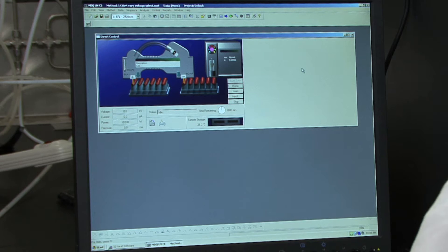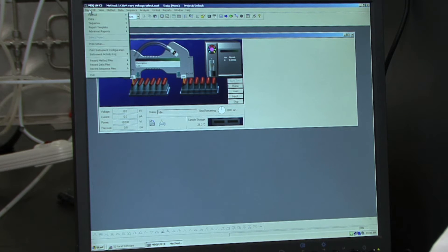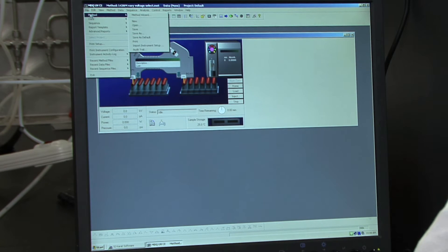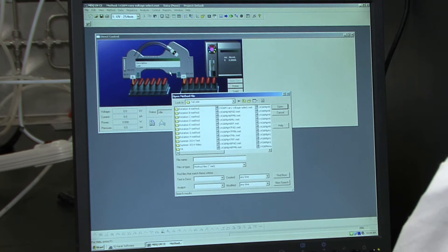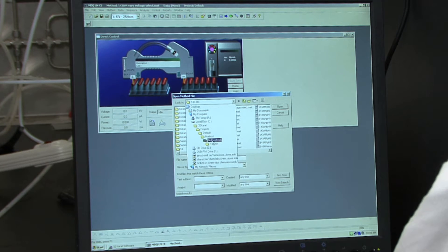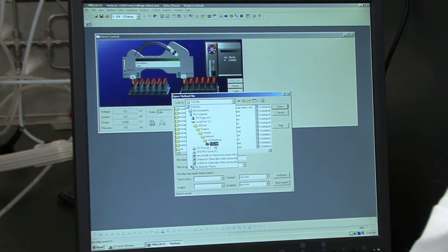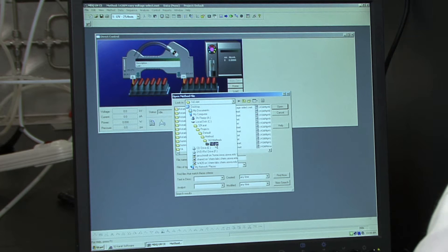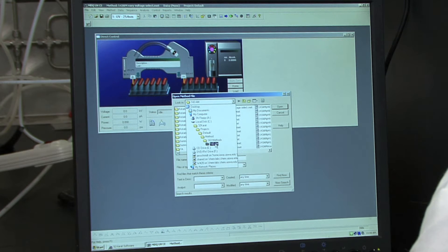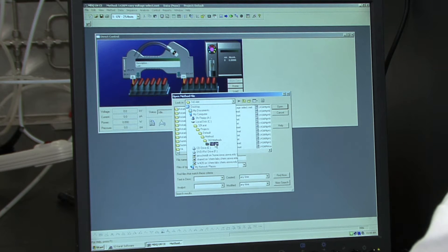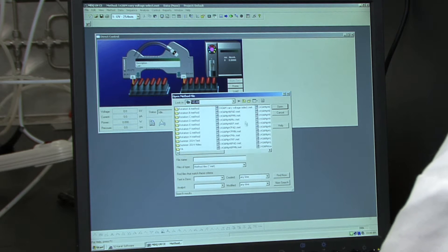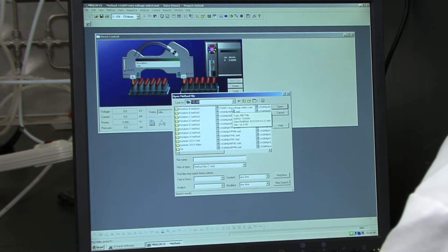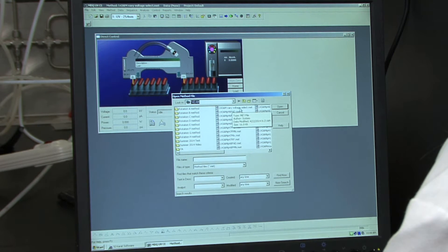And you want to open up your method that you'll be using. So to open up your method, you can go to file, method, open. I'm opening the method 143AM. So if you're in the AM, open the AM method. If you're in the PM, you can open the PM method. And I'm going to open up the variable voltage method.